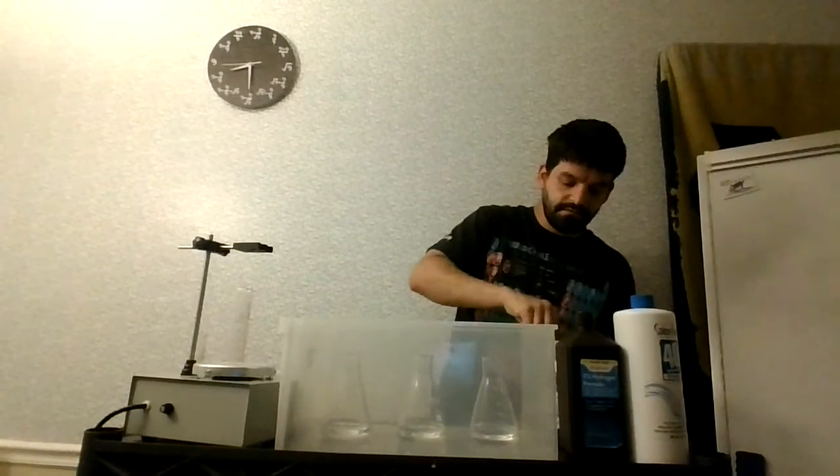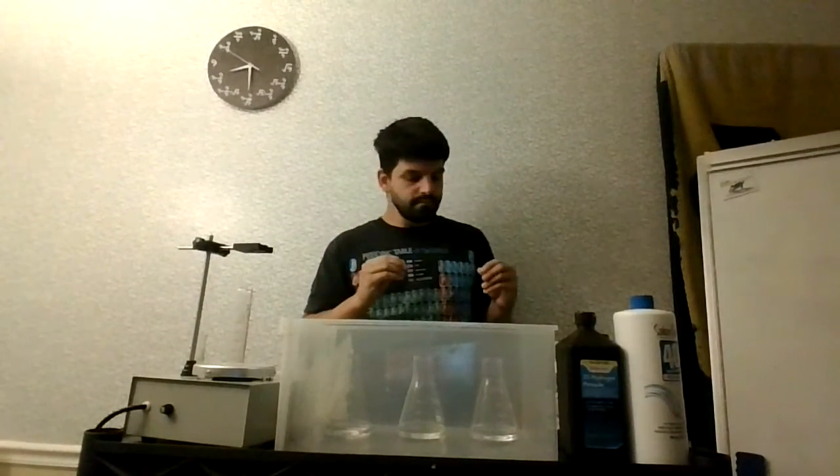You're still going to want a funnel, and again, we have that hack that if you don't have a funnel, you can use the trick of taking one piece of paper and going across to the opposite corner to make that conical shaped piece of paper where you're able to keep your reactants contained into the vessel that you want.